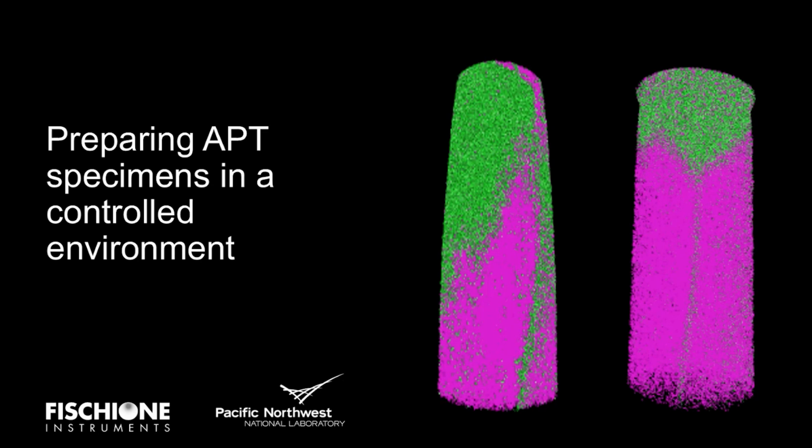I have another one for you, Daniel. It follows the previous question. Is there any advantage of argon ion milling techniques in APT specimen preparation?